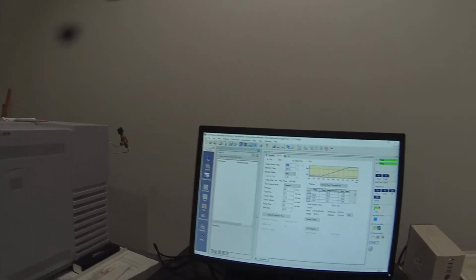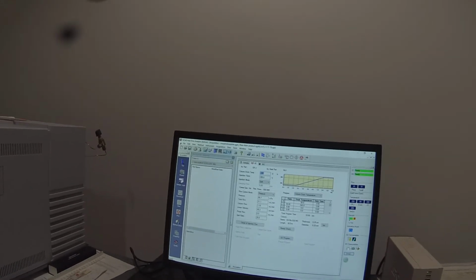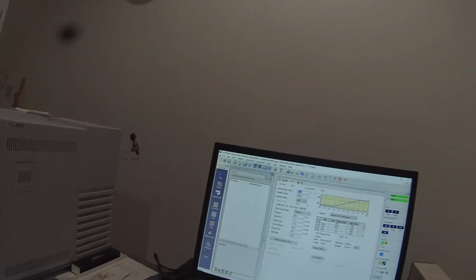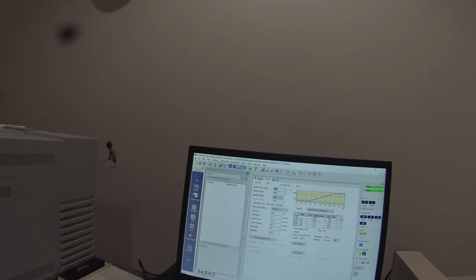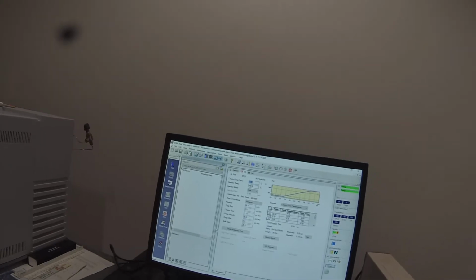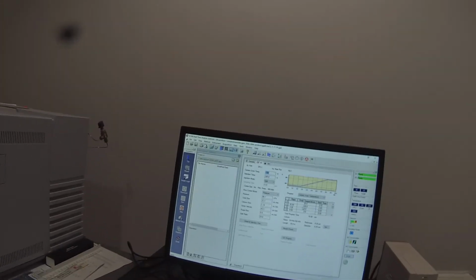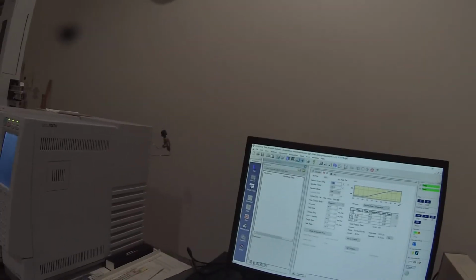And I'm really not sure what we're going to see here, because I don't know if the product has a suitable volatility to come off under these column conditions. But it's a good starting point, and it works well for a variety of solids. You'll notice if you compare the GCMS method for the last lab of the semester, the bromination of acetanilide, the conditions for running the sample are identical to those for the morpholine lab. So we're going to hope that identical conditions will also work for the Diels Alder lab.